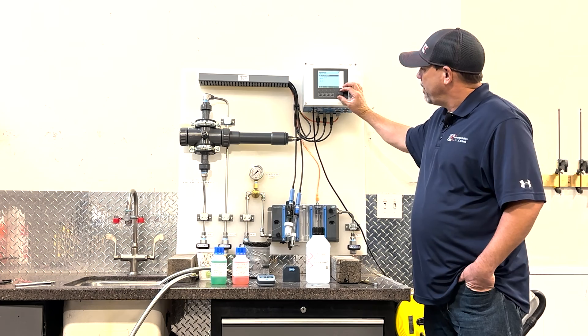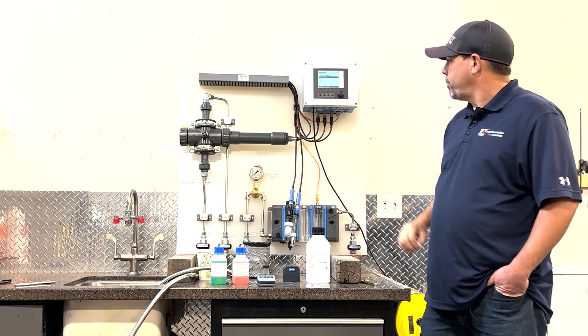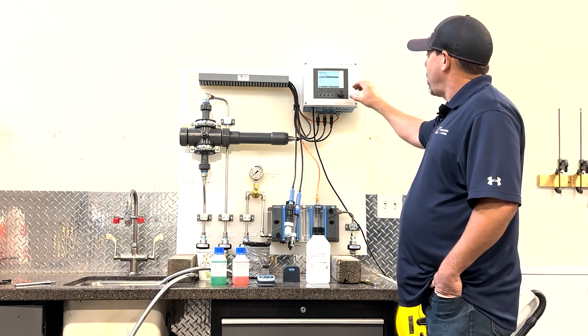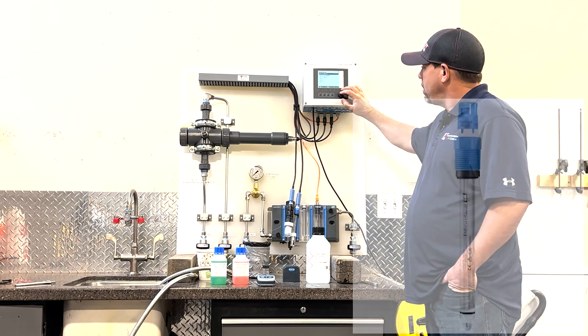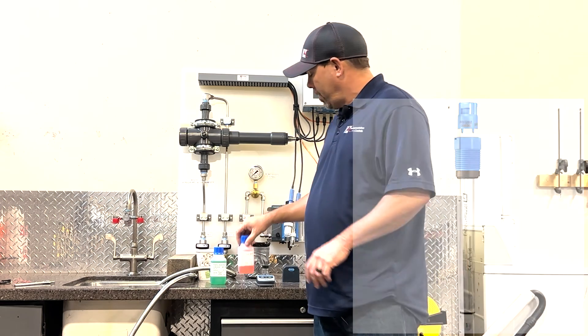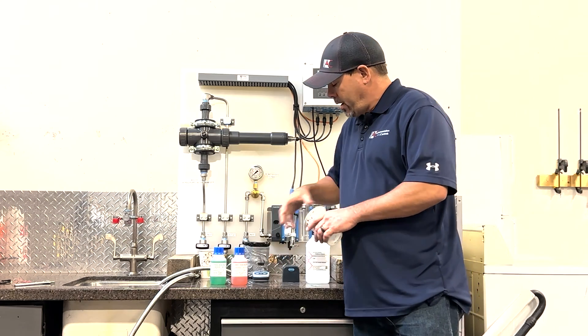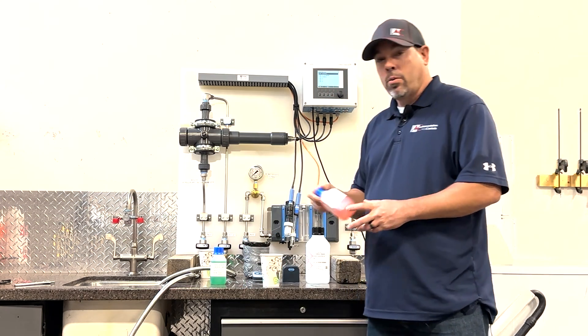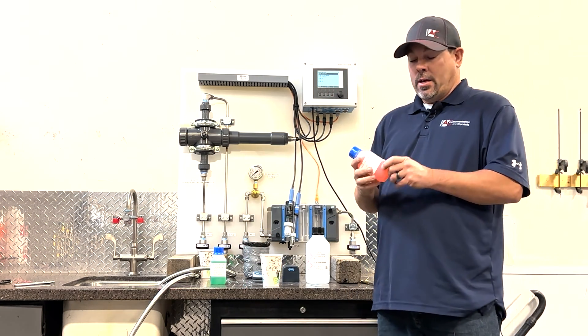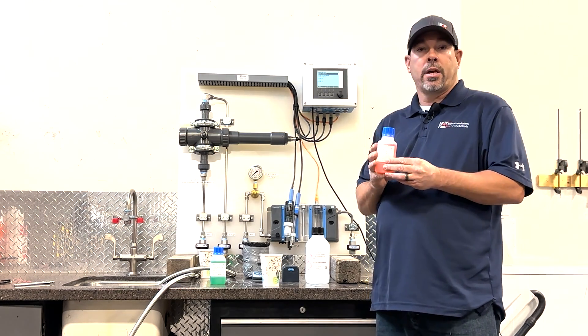We have three sensors here: pH glass, free chlorine, and nitrate. We will start off with pH. We're going to prep our solution — we have a 4 and a 7. We're going to use some cups for the solution. One thing you're going to want to do is check the expiration date to make sure the solution is not expired.